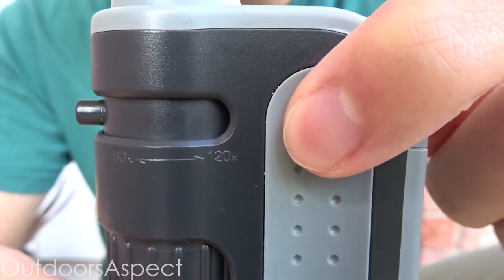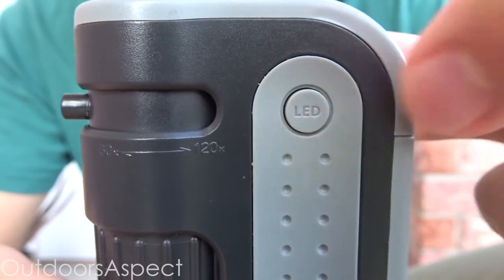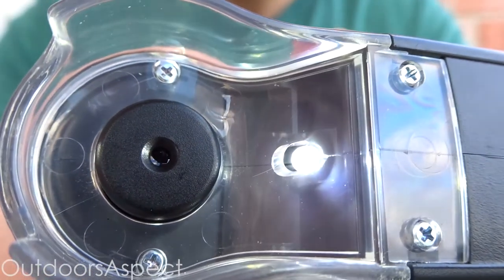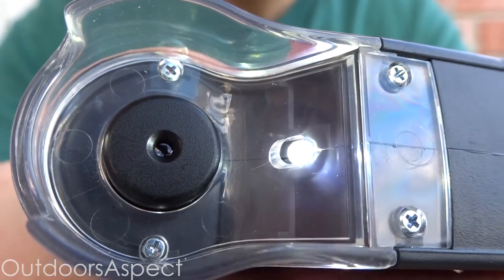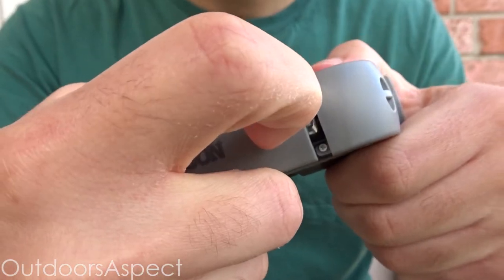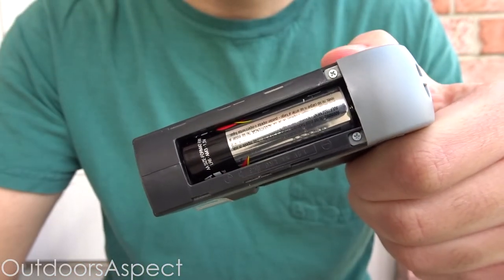Next we have the LED light, which is very important — without it you won't be able to see your specimen properly underneath the microscope. Lastly, there's the location where the AA battery goes to power the microscope's light.